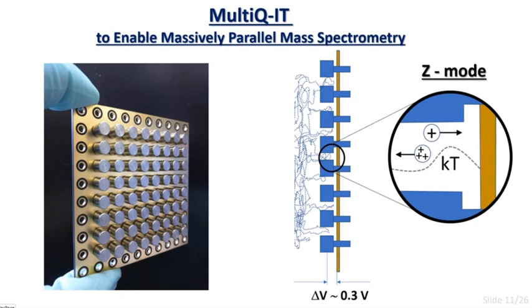So that produces an effect that lets us get rid of singly charged ions preferentially and keep inside multiply charged species. Remember, we have 486 exits, and that enables us to multiply the effect to the point where we observe it as ions enter and exit the device. So I have sometimes compared this to an online dialysis system. It's equivalent.